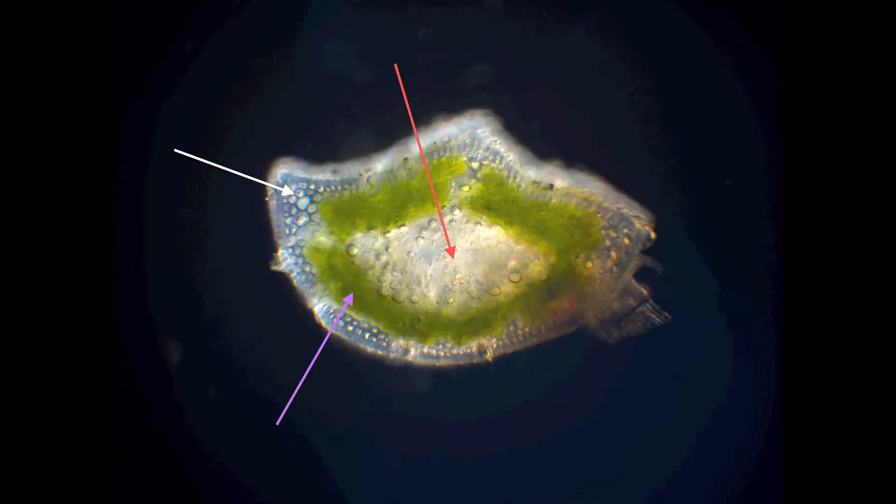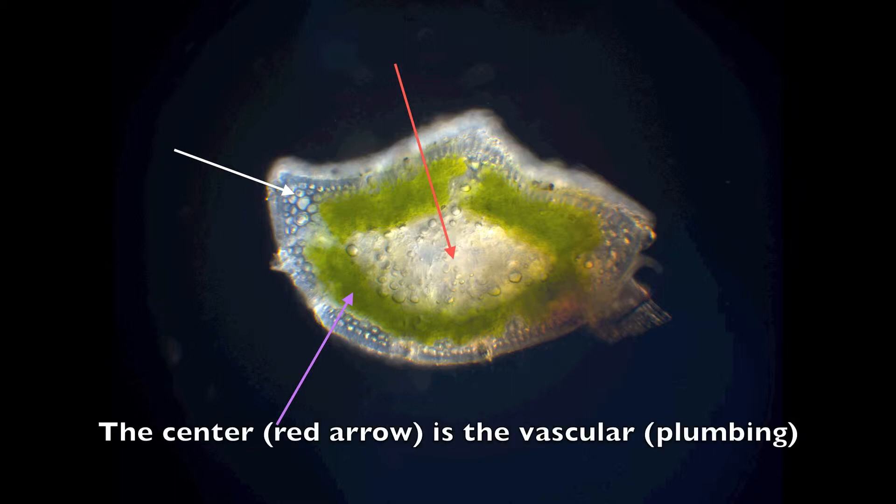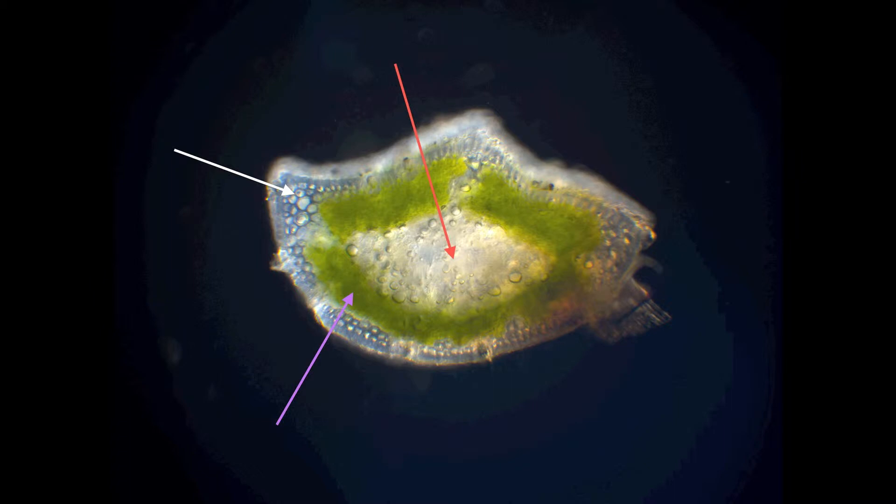Here's a cross section in dark field with several arrows that point out structure. The purple arrow points to the mesophyll where the chloroplasts and all the chlorophyll is. That's where photosynthesis takes place. The red arrow is pointing to the vascular bundle in the center where everything is transported in and out of the leaf. Now notice all the bubbles in the center, those will go away when we do fluorescence. And the white arrow points to structural tissue.